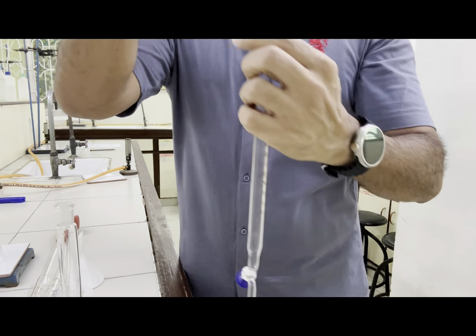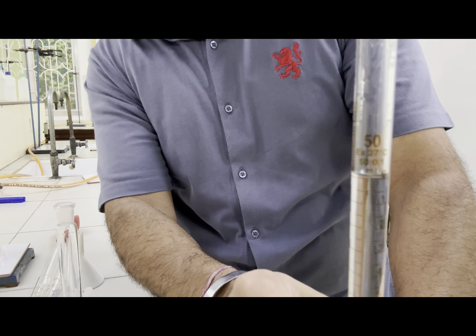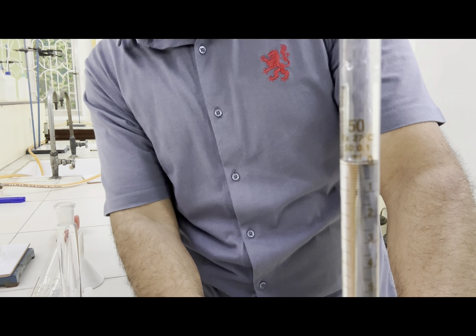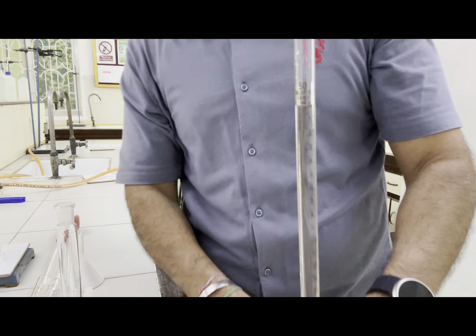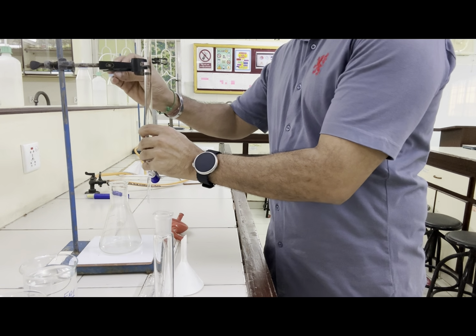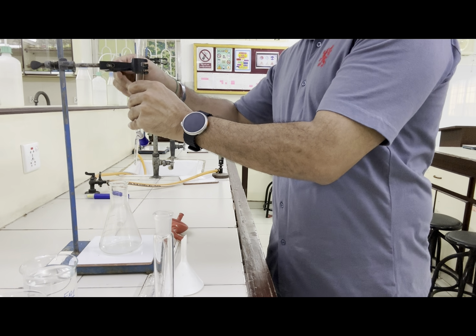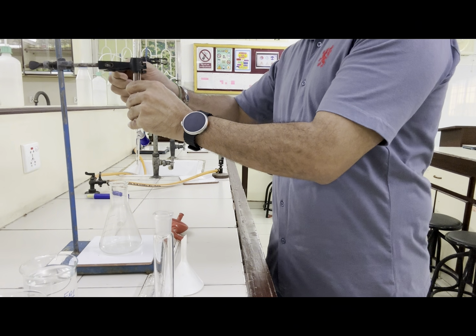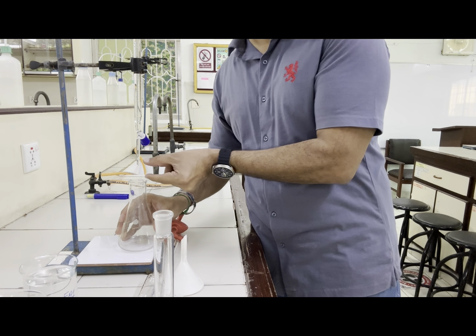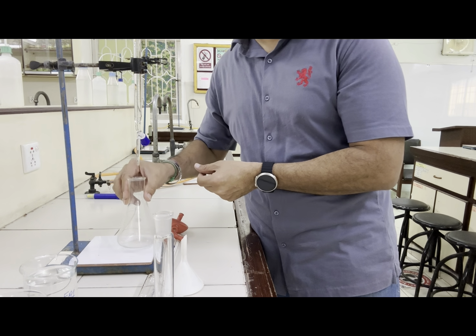Now, if you see closely, I have filled it up till the 0 mark only. So this reading is taken as 0. Now place this burette in the retort stand. The level of this burette should be 2 to 3 inches above this flask. So here you have a space of 2 to 3 inches so that you can swirl easily.